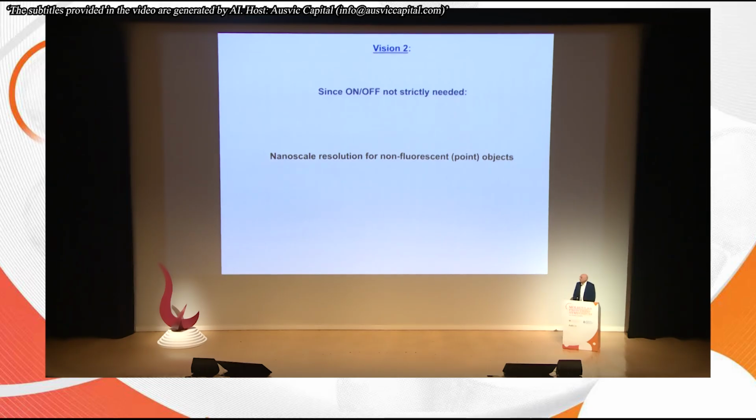There's another avenue coming up. So far, all this subdiffraction imaging was fundamentally limited to fluorescence. And you ask me why. When I looked into the problem, I actually wanted to break the diffraction barrier in general, not just for fluorescence microscopy. There was no particular reason. I was a physicist. I had nothing to do with bio or so. And then I figured out that overcoming the diffraction barrier is easier for fluorescence because you can play with states. And that was arguably my first big idea. I realized that if you play with the states of the fluorophore, then you can make them separable. Now, here, we didn't have to do this anymore.